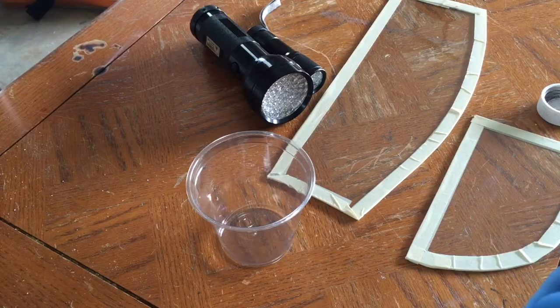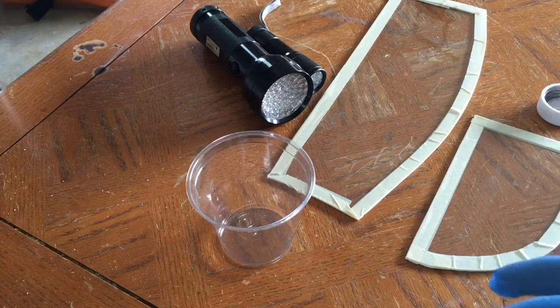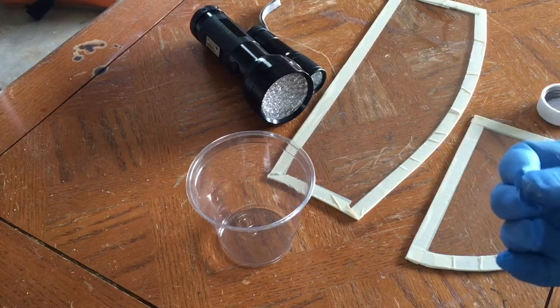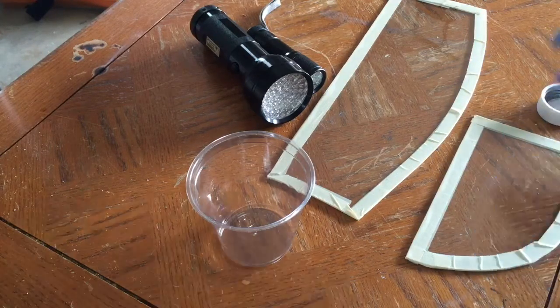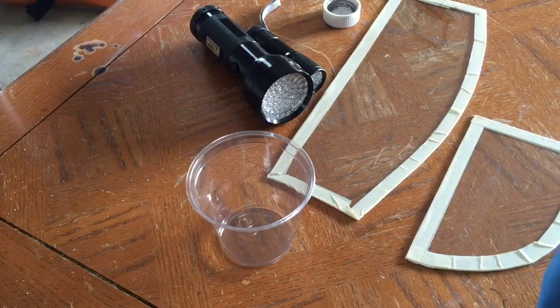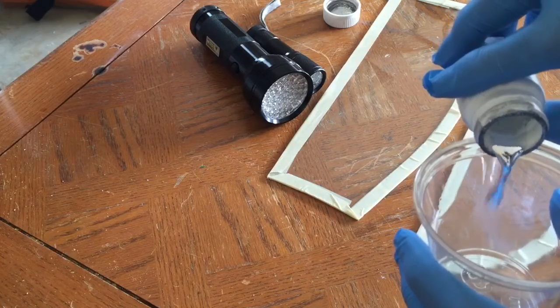Unlike mercury, gallium tends to coat surfaces, so if you get it on your hands it forms a grayish discoloration of the skin which is hard to wash off — that's why I'm using gloves. But that property is also useful for making things like mirrors and other shiny surfaces, so I don't pour too much on the glass.